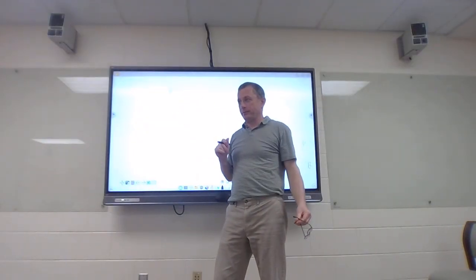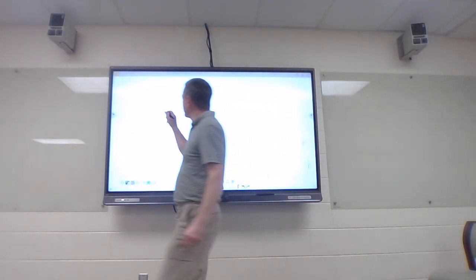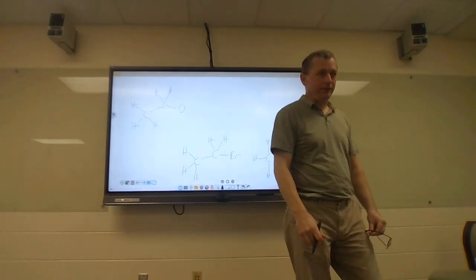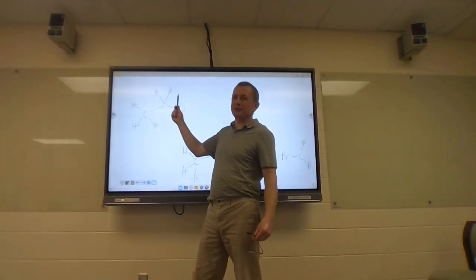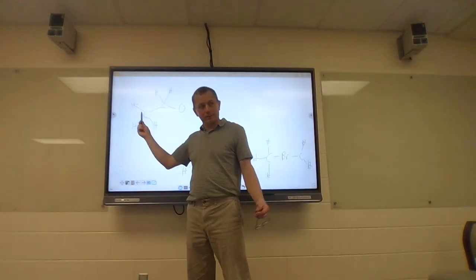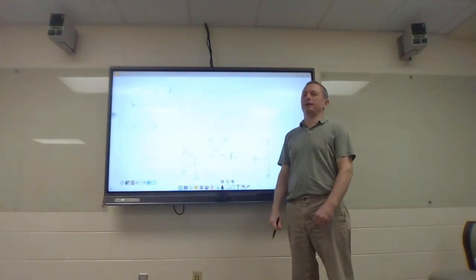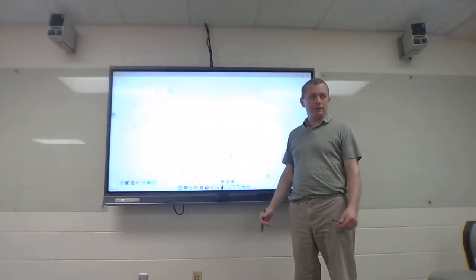Now, my next peak. Up around 1 again. And there's 3 of them. So again, I'm seeing that pattern again. And I can even look at the splitting, and I can see that this one is 4 and that one is 3 again. That same pattern is there. What's the problem? You're missing half the molecule. I'm missing half the molecule, and I can't add more oxygens. If I can add more carbons, I can add more hydrogens.